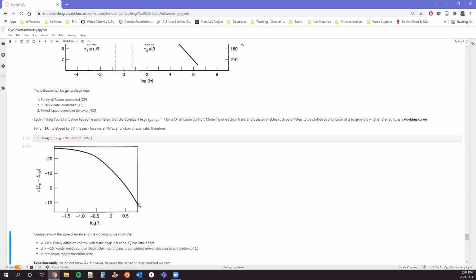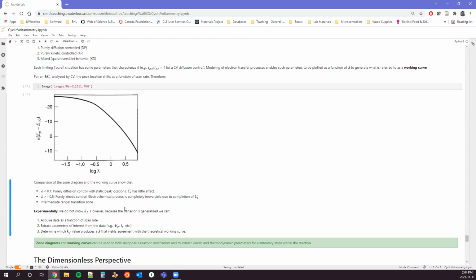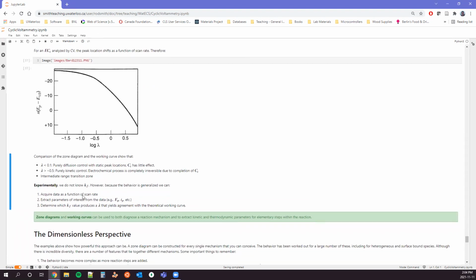And then as we decrease our scan rate, we'd start seeing a change, right? And so the shape of our peak would change. These can become very useful because this is dimensionless, it's telling us general behavior. And so experimentally, we often don't know anything about that chemical reaction. That's what we want to find, right? We want to learn about the kinetics of that chemical reaction, for example. And so we can use these plots to derive that information, to measure that information.